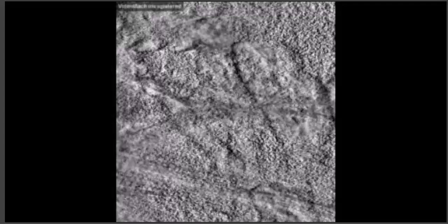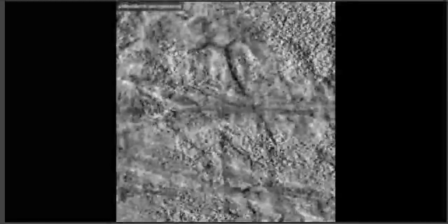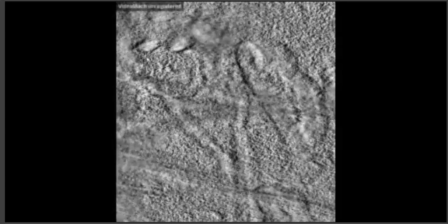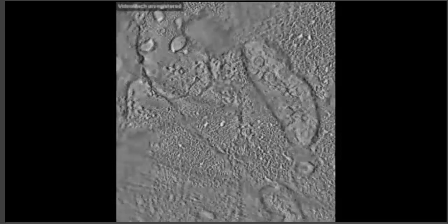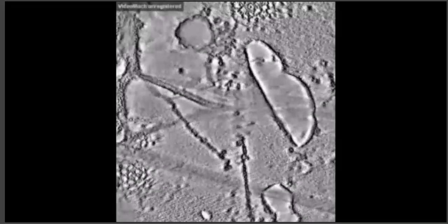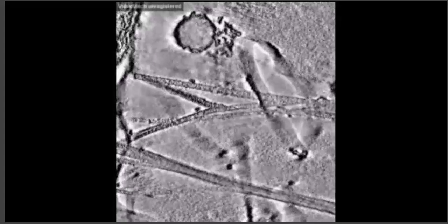Exactly, and that's why we want to do this on vitreous material. And there is some deterioration of the sample with this coating? There's obviously going to be dehydration artifacts. But more importantly, we don't even worry about those because we're at so low resolution. We're literally looking just at the heavy atoms on the surface of the biological molecules, which we are assuming are probably no longer there. Let's go to the next slide.